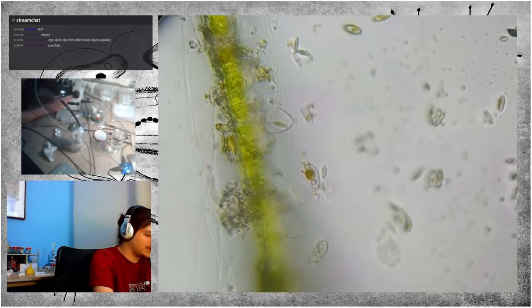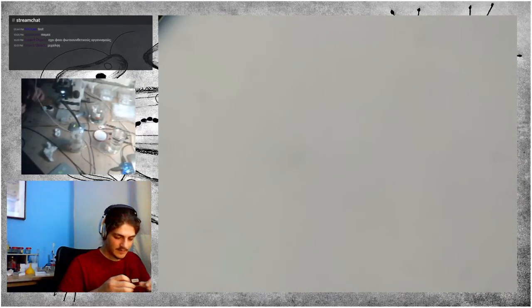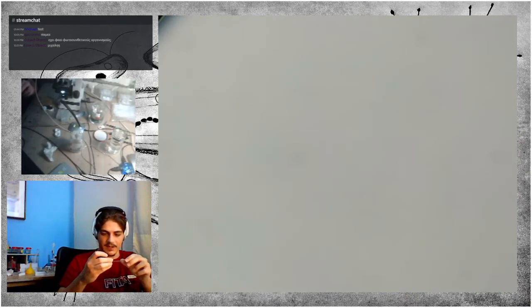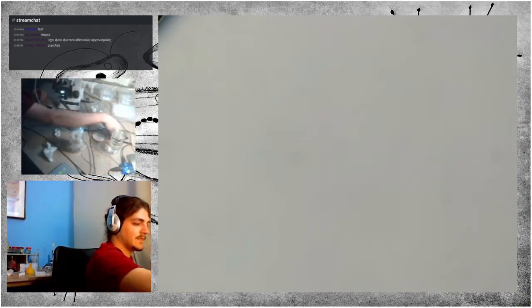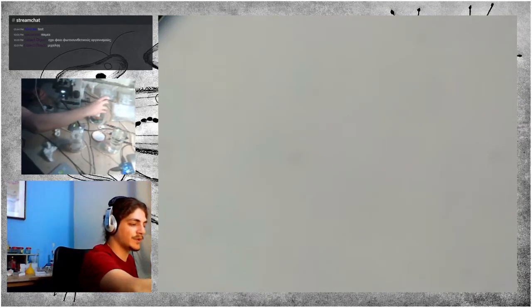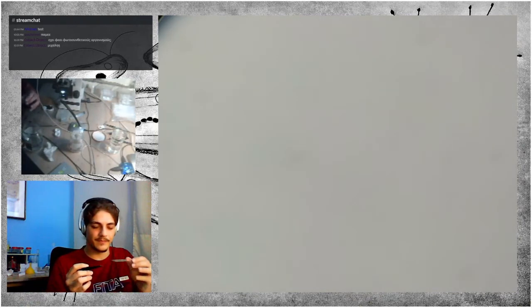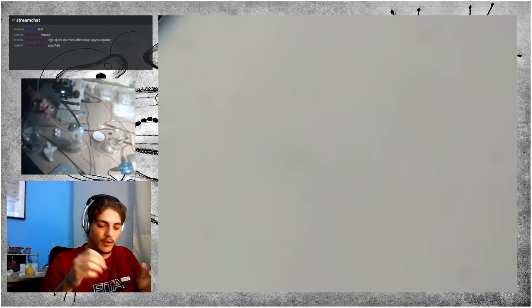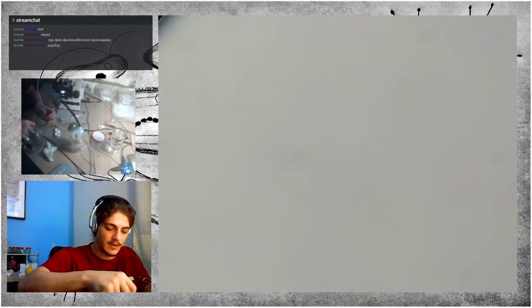Now let me add a little bit of water to replenish the water in the slide, because it has started being too little. Now there is a very good way to add water to a slide without removing the cover slip, or putting water onto the cover slip.